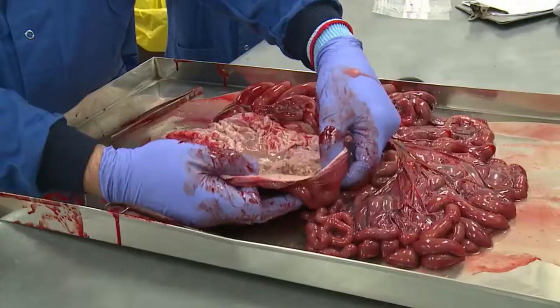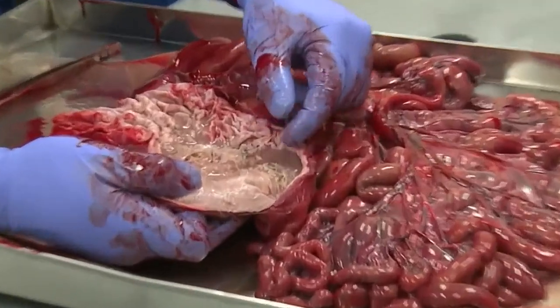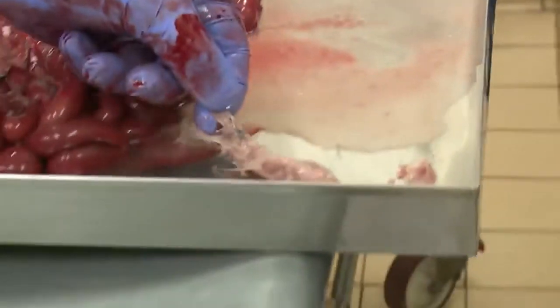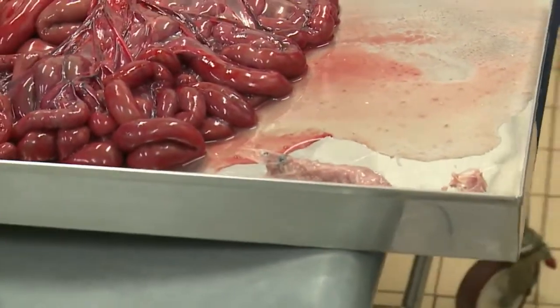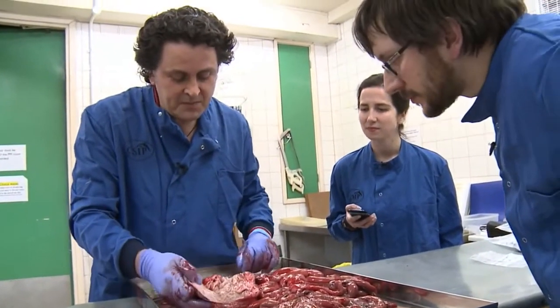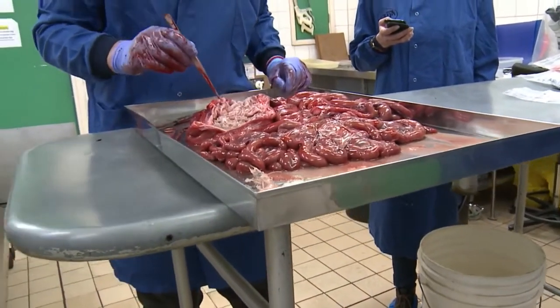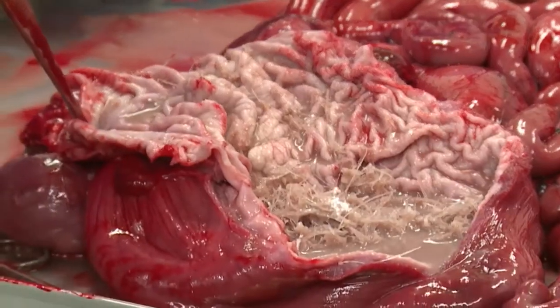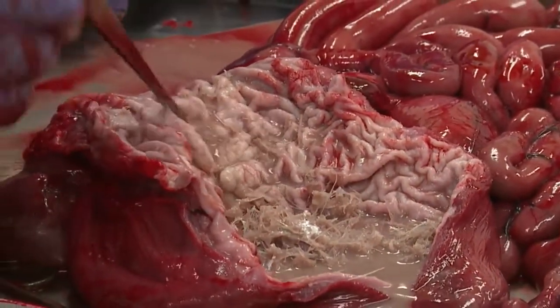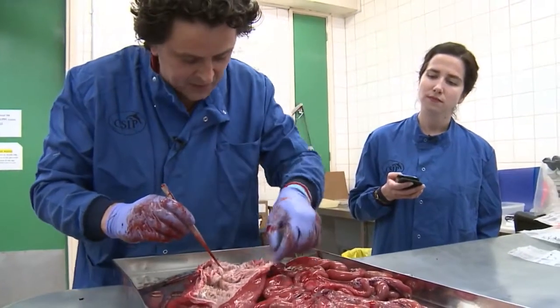Okay, so I'll try and poke around a little bit here to show what we're talking about. We've got some bones. So there's a recently ingested prey item. I have literally no idea what that is, before anyone emails in. This is another sample we'll collect for some collaboration with colleagues. So these will go off to our close partners, the Sea Mammal Research Unit, for analysis of stomach contents. And what I'm really trying to look for here are the otoliths, or the ear bones of fish. So I'll see if I can find one to show you what I mean.